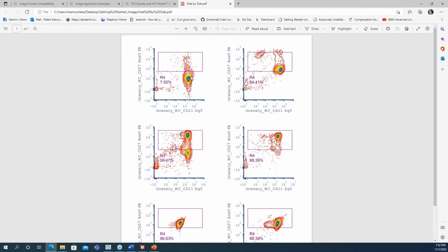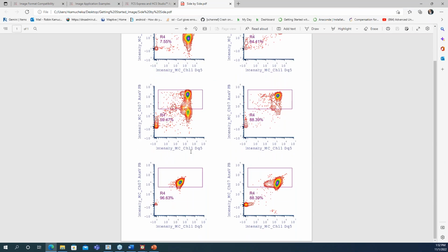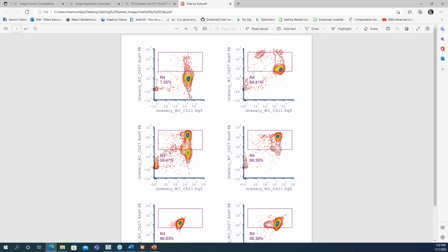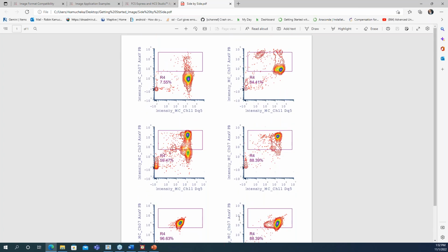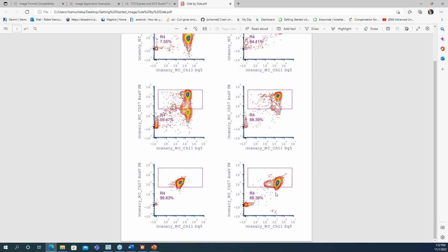And then this is my side by side. So I had told it 2 and then 3, so I could look at these 6 different iterations here, my 6 data files, and see what was changing between each data file. Again, super useful for a reportable if somebody just wants the quick, okay, what has changed? What looks different between my different samples and my different populations?